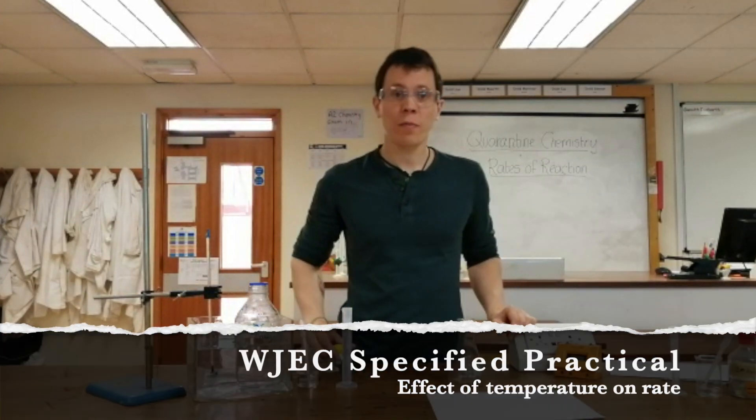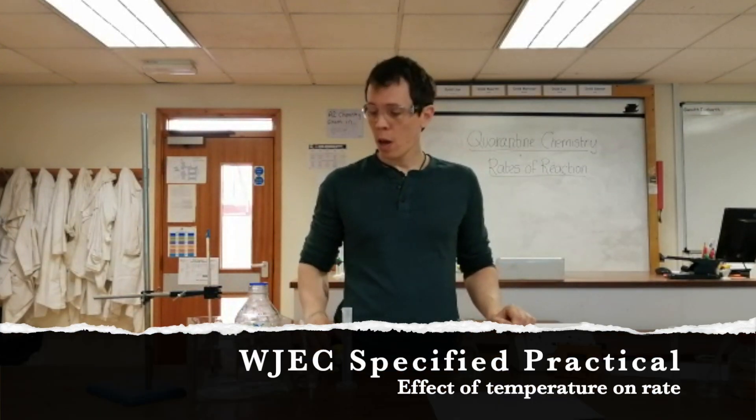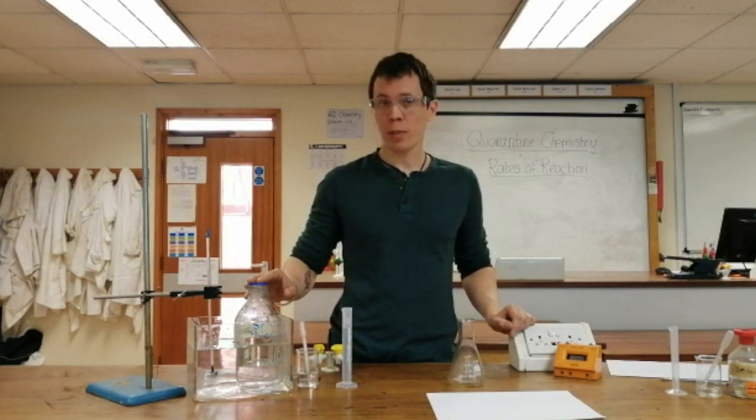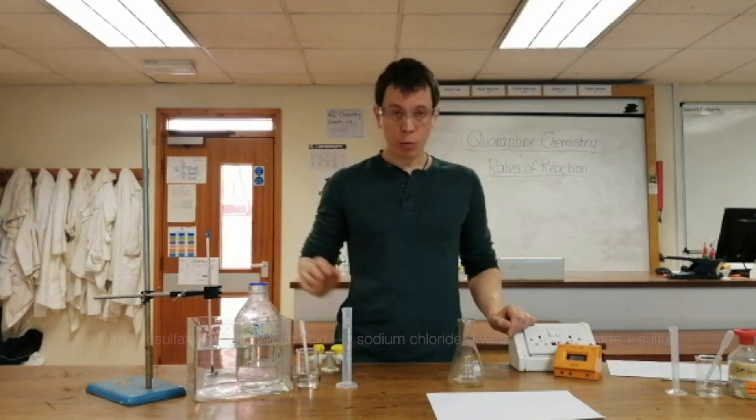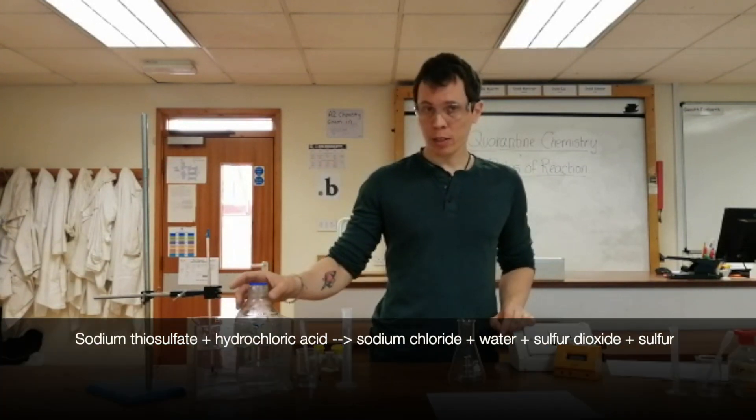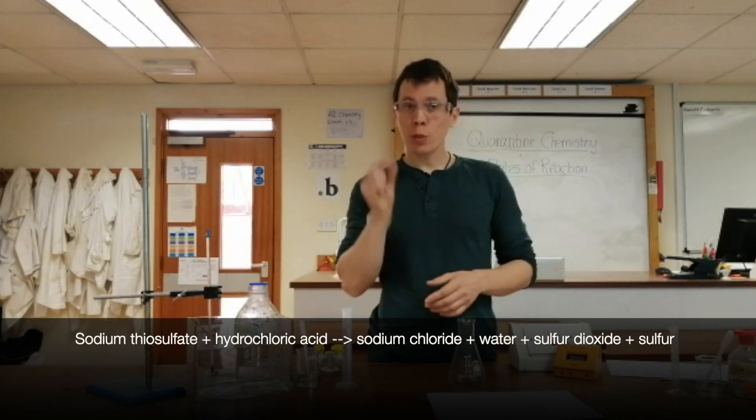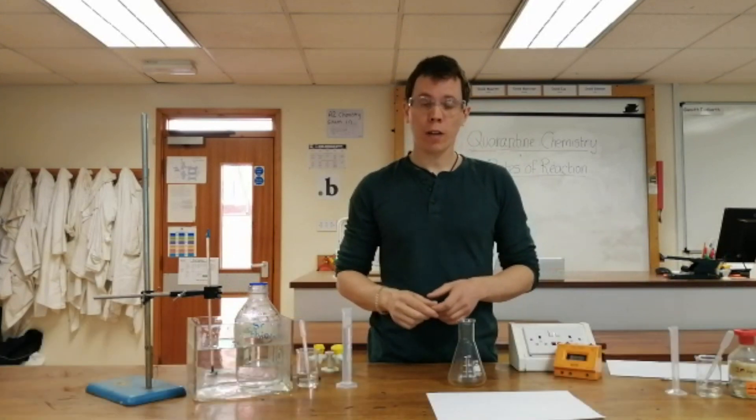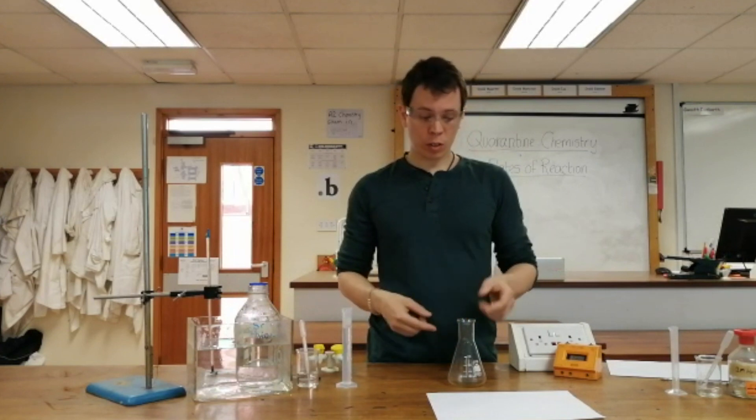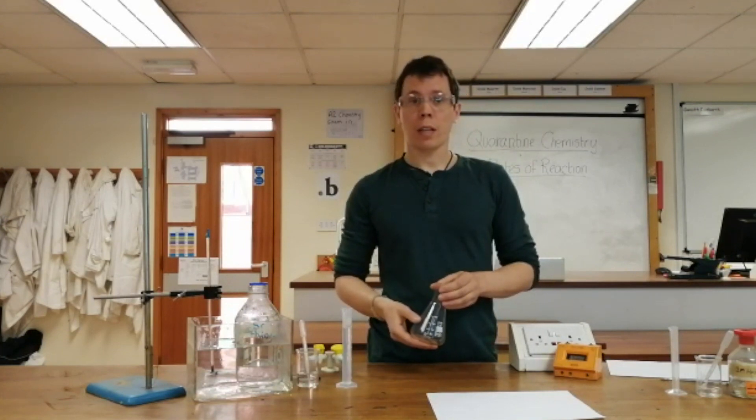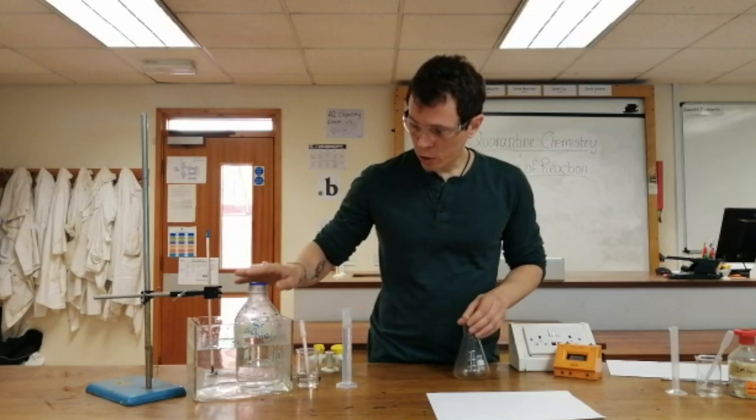In this experiment, we're going to investigate rates of reaction by changing the temperature of sodium thiosulfate solution. The reaction is between sodium thiosulfate and hydrochloric acid. When the two react, they form small solid particles of sulfur, which makes the mixture become cloudy. I've got my sodium thiosulfate in a hot water bath at about 60 degrees.